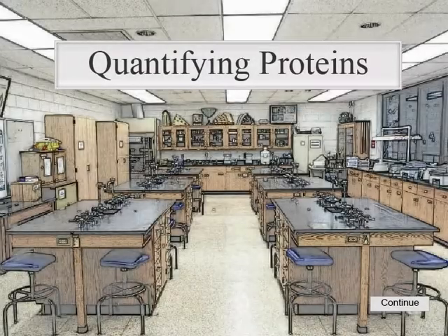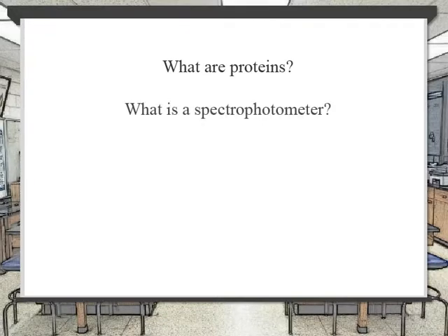In this lesson, we will talk about what proteins are, what a spectrophotometer is, what the Bradford assay is, and how it can be used to quantify the amount of protein in a solution.